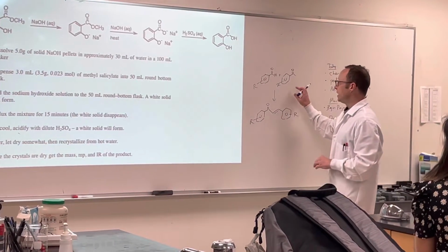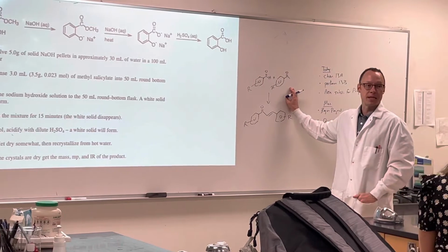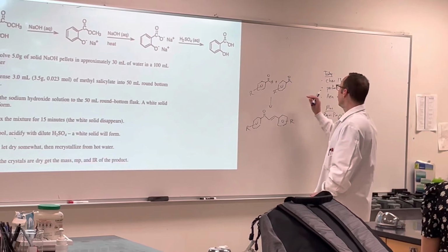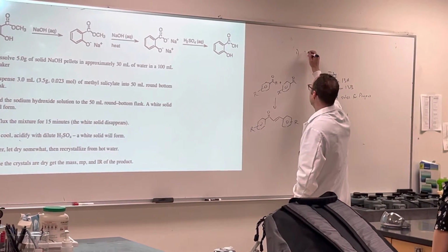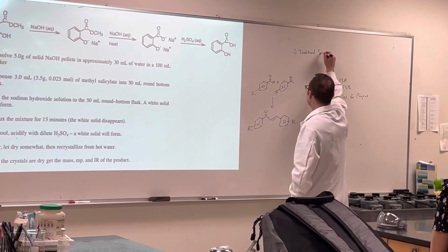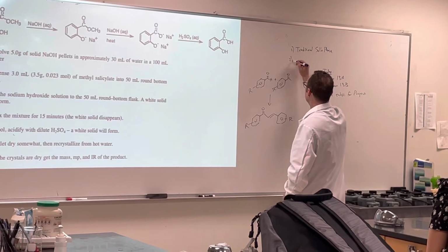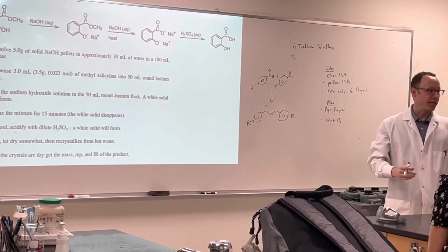The other aspect of this is there are two different procedures. In addition to being assigned your aldehyde ketone pair, I'm also going to assign you one of two procedures. So one of which is just kind of the traditional solution phase reaction. This is the way you think of doing the reactions all the time.